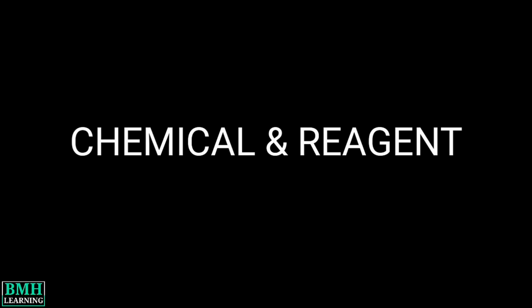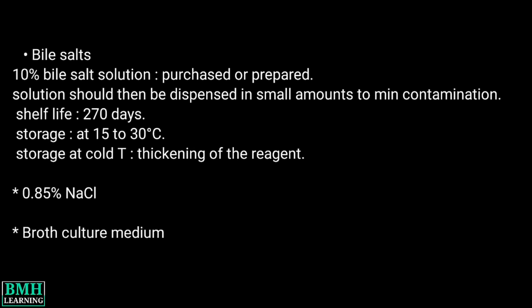Media, reagents and supplies used. Reagents: bile salts. A 10% bile salt solution can be either purchased or prepared. Bile salt can be prepared by adding 10 grams of sodium deoxycholate in 100 ml of distilled water. The solution should then be dispensed in small amounts to minimize contamination.